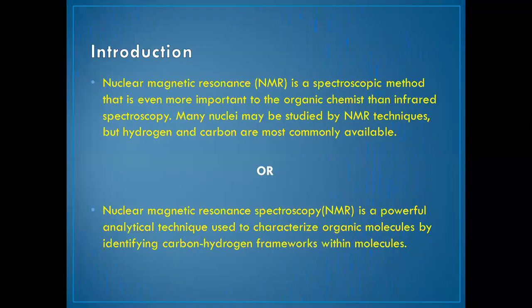What is NMR? Basically, NMR spectroscopy is a powerful analytical technique used to characterize organic molecules by identifying carbon-hydrogen frameworks within molecules. It is a technique that exploits the magnetic properties of nuclei. It determines the physical and chemical properties of atoms or the molecules in which they are contained.